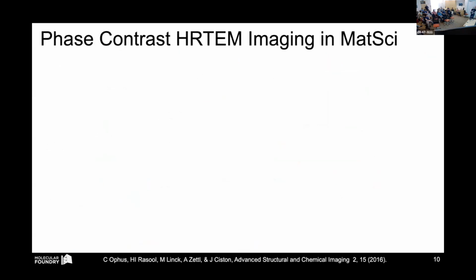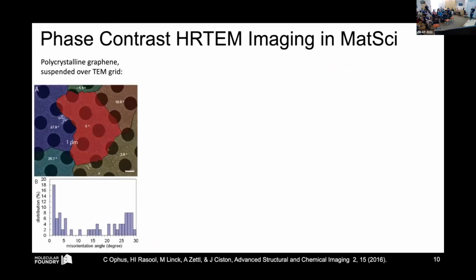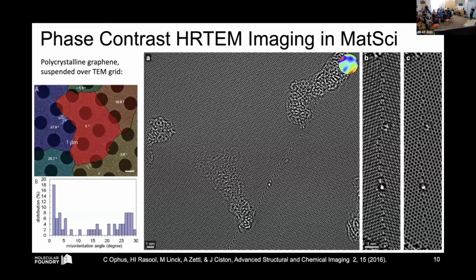Very, very flexible. Okay, so phase contrast imaging is really what I'm going to talk about here today primarily.